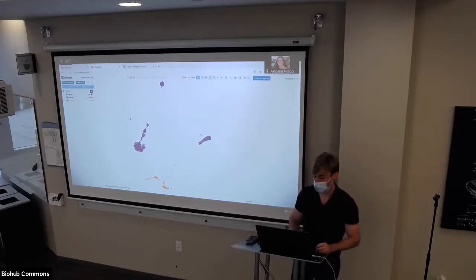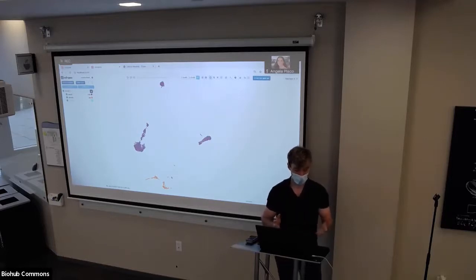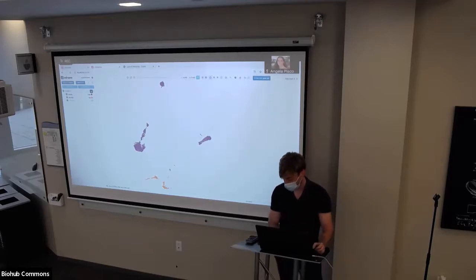Later on, I'll show you how you can use the front end to actually correct this obvious batch effect. You can see that these are both PBMC data sets, but their cells are completely separate from each other. This is something that you would use the front end to correct for. But for now, we're just going to use this view to explore some of the interactive features of cell by gene.